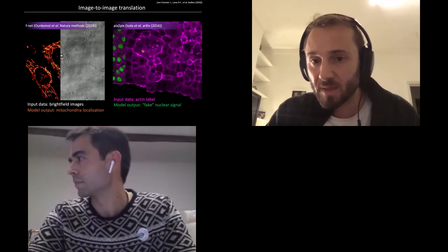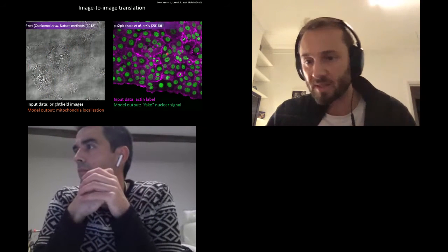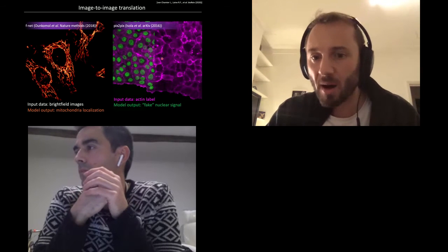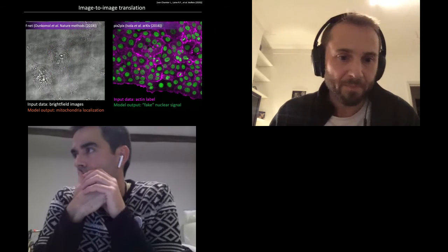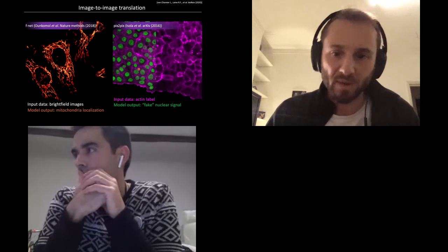And so what this means is that, again, from the trained network, you'd be able to do away with having the DAPI staining altogether, and therefore extract nuclear labeling straight away from just one single labeling. And so that's also another approach that, in my view, would be very difficult with classical algorithms.